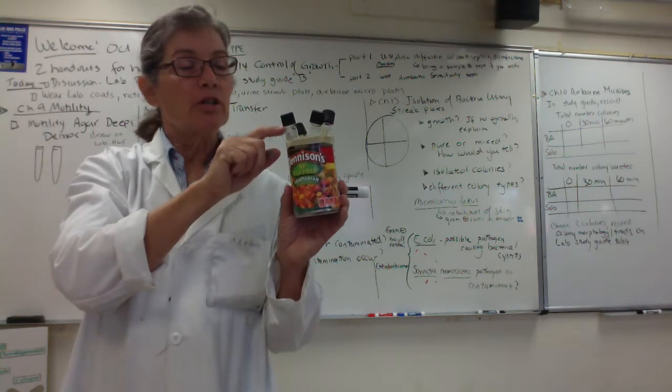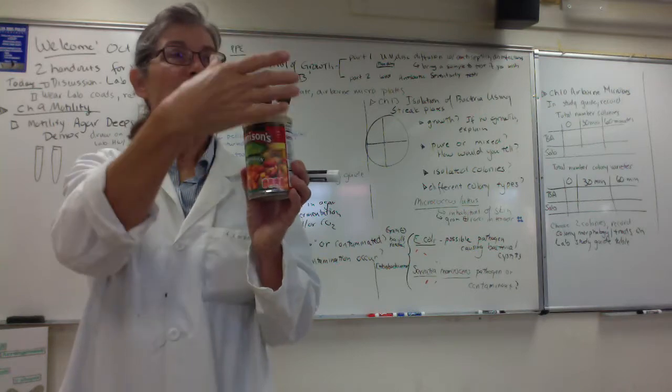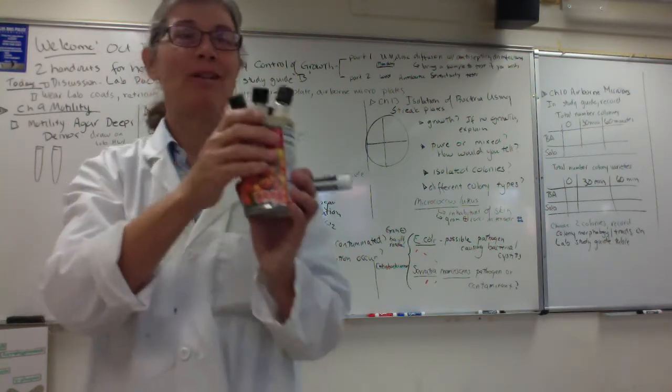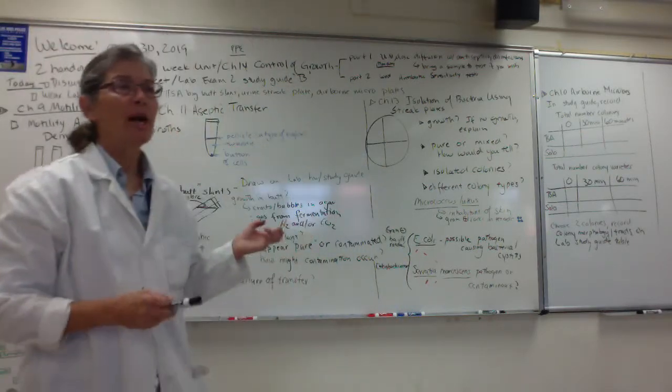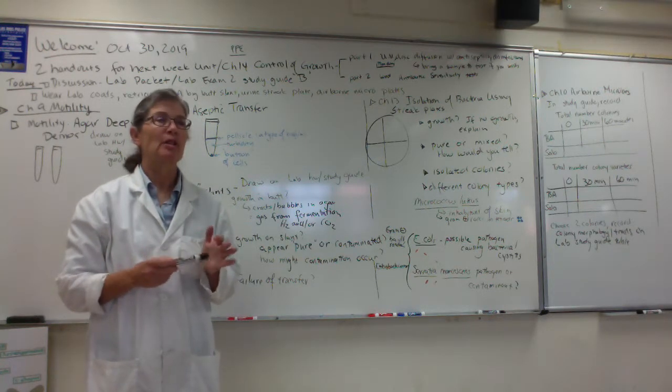There's so much pressure, it forces the agar out beneath that loose cap, and you actually have microbes and agar on the outside of your slants. It's pretty impressive, right? But we want to make sure we keep you all safe. Good job, you guys. So the cracks and bubbles are evidence of growth, evidence of fermentation with gas production.